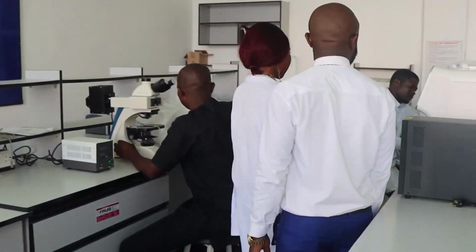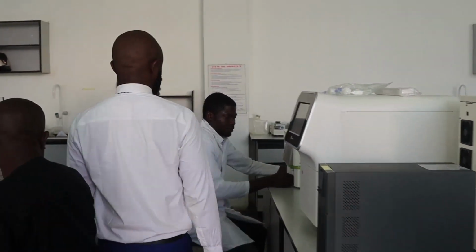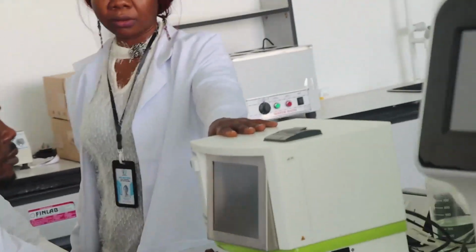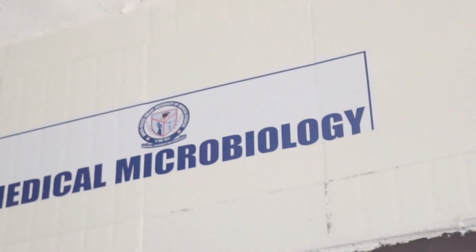So this is our CD4 count machine. Yes, okay, so you're welcome. Like I said before, we have four units under the laboratory department, and here is the microbiology unit.